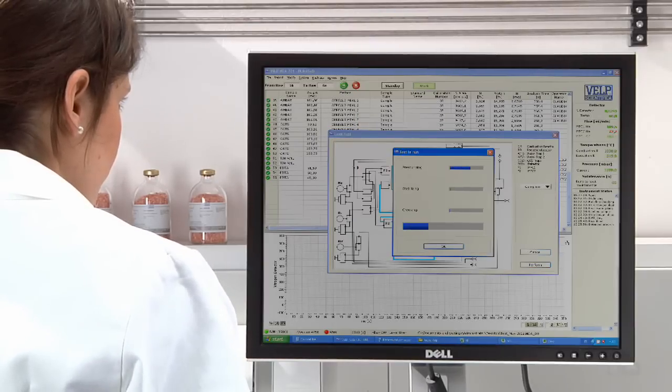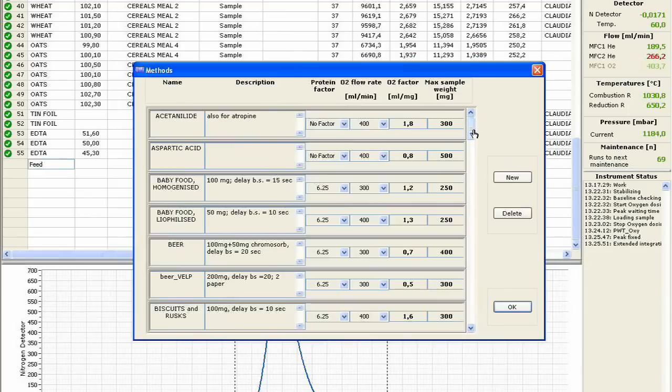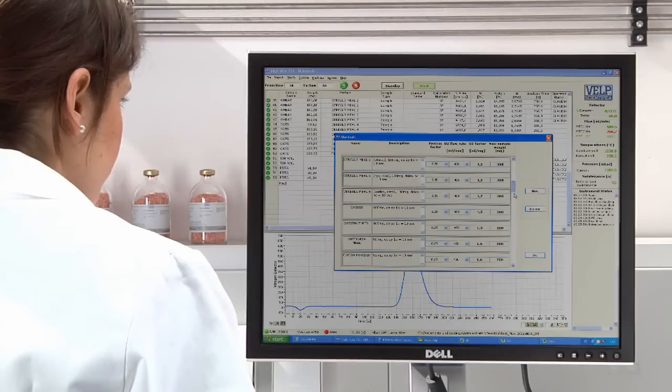The Dumasoft is quick and simple to use with all the program parameters, run conditions, and results displayed on a single screen of your PC and is available in different languages.